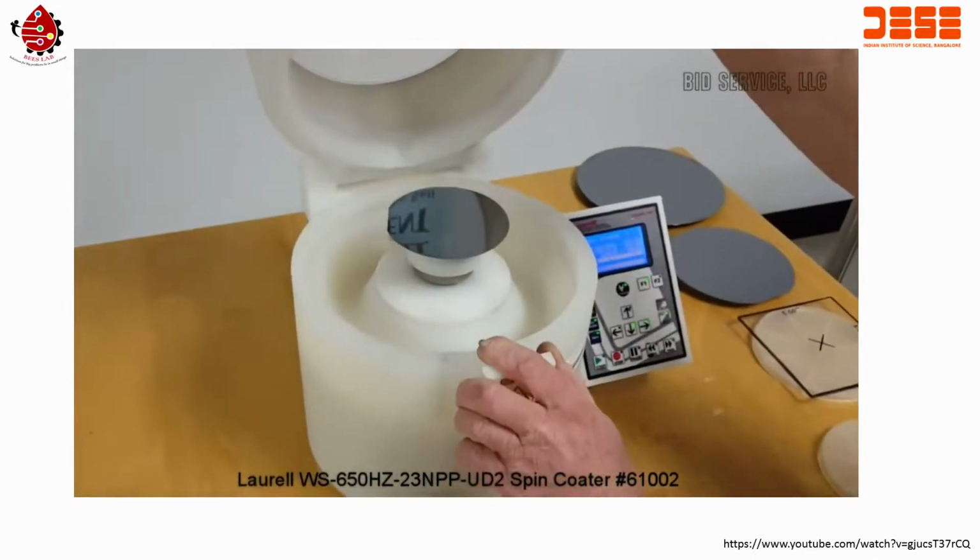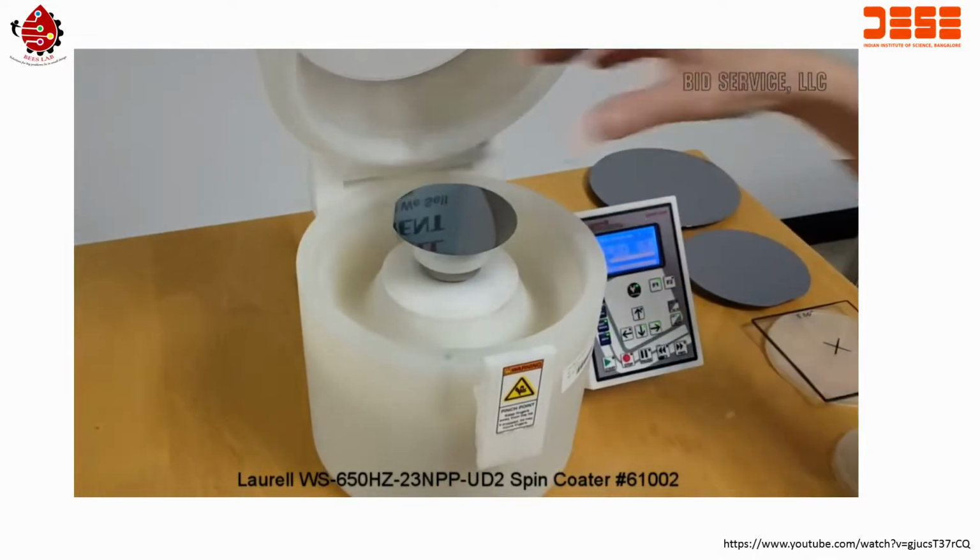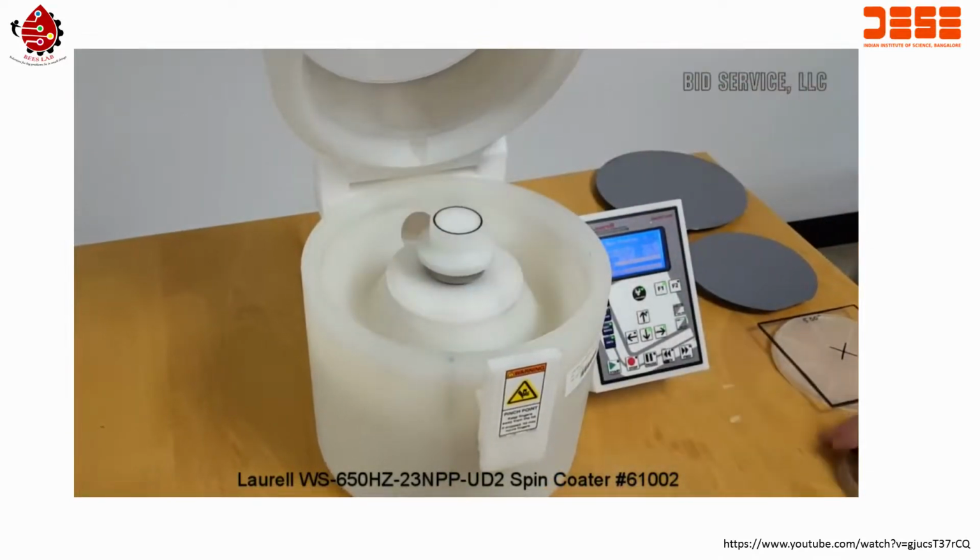Done. Turn off our vacuum. Move our wafer.